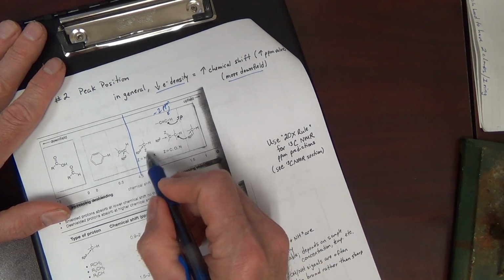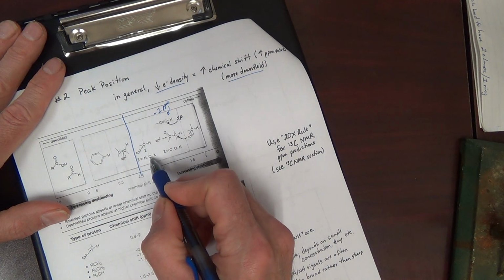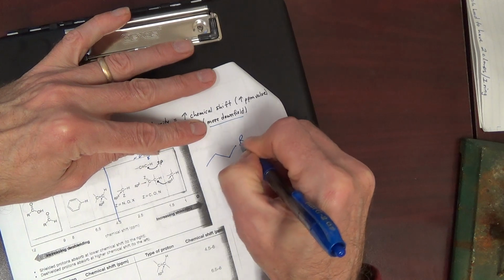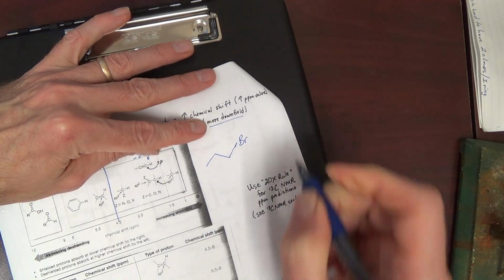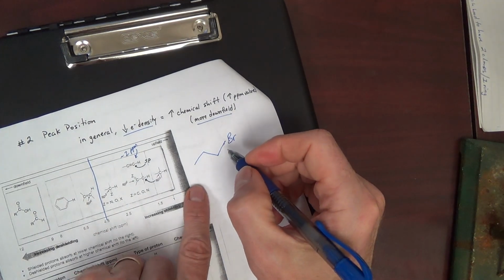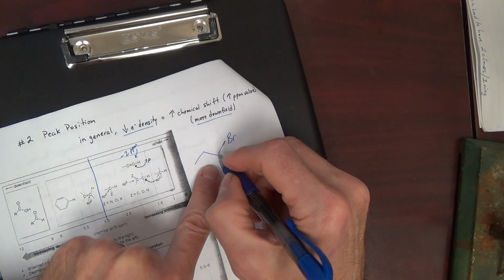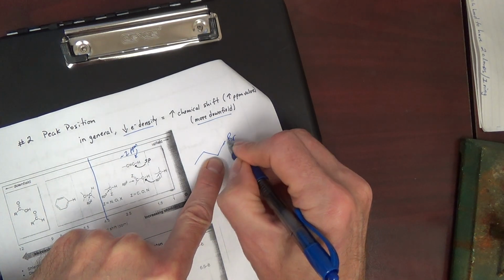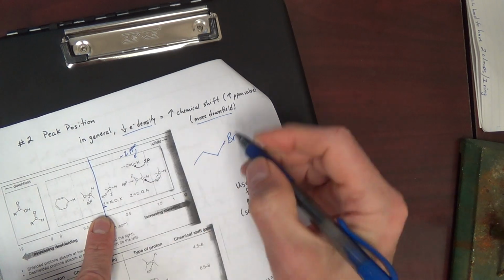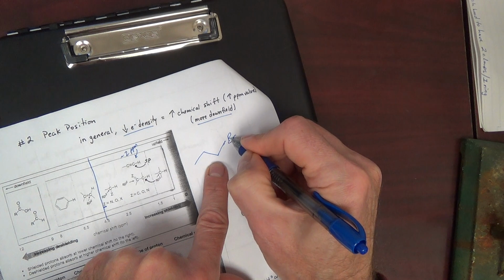If we start having an electron withdrawing group or atom, like a nitrogen, oxygen, or halogen, something like this, which we've seen before, the carbon is bonded to a Z group.